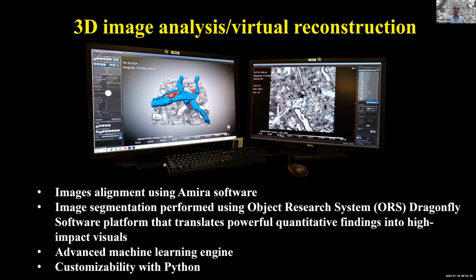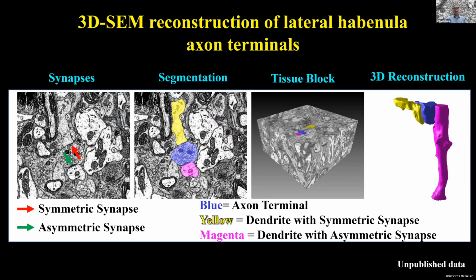So here's our result. For this type of neuron, we did not label the neuron type because we tried to label with gold particles, but we had charging problems.